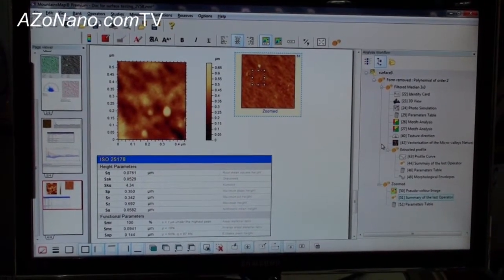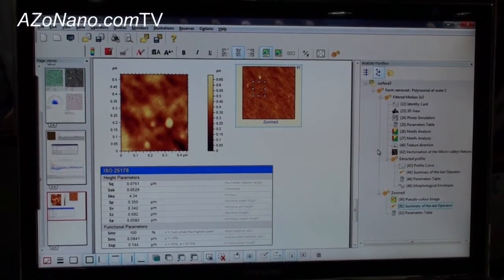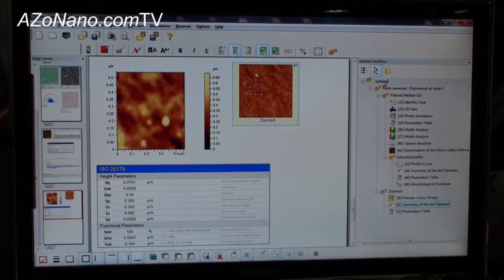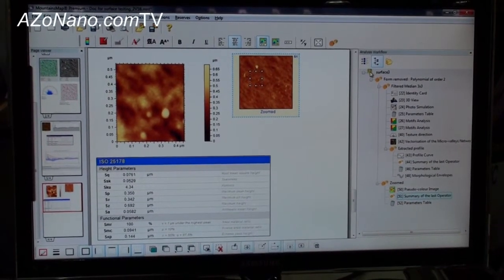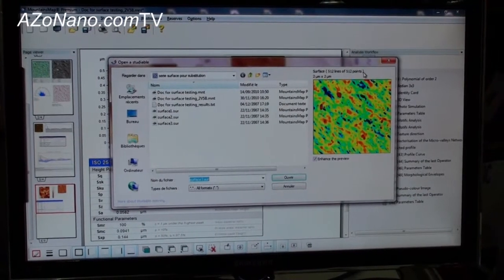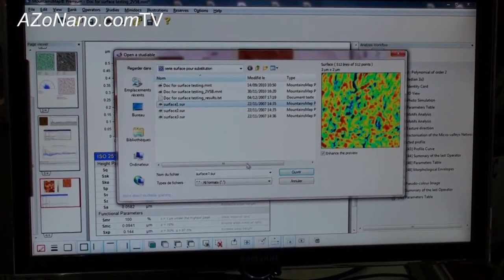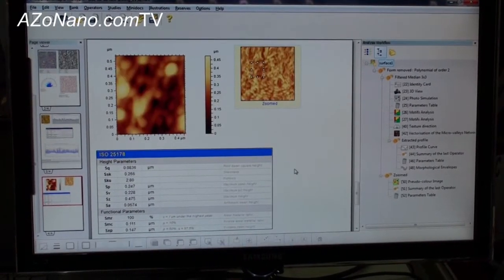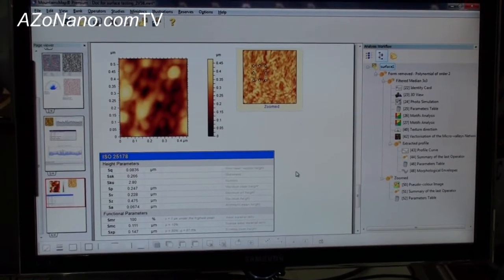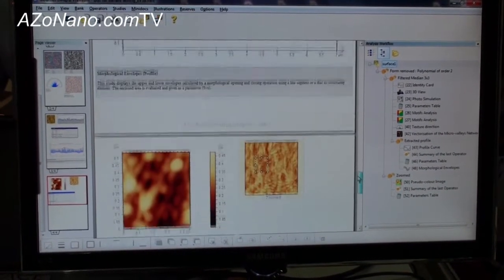But the real magic thing from the mountain software technology is the interactivity with the file itself. So as you can see here, I was using the surface number three. If I double click on the surface number three, I can switch to another one, maybe the surface number one, and then the document is automatically recalculated with a new surface. So we can check it.